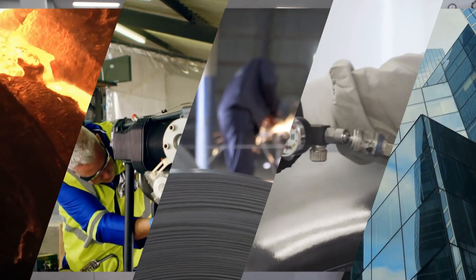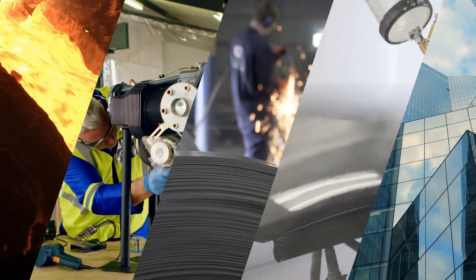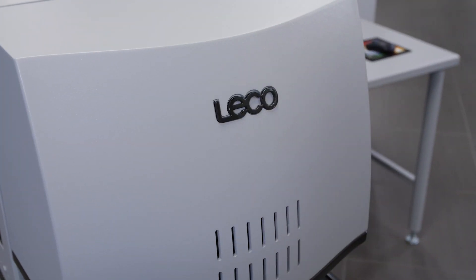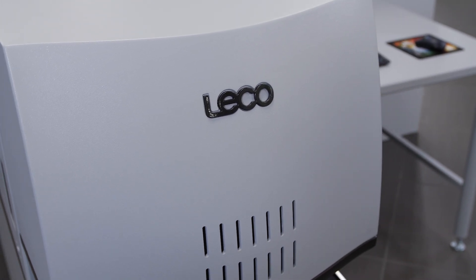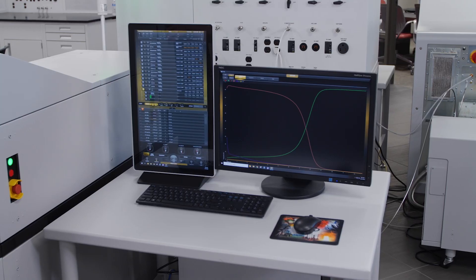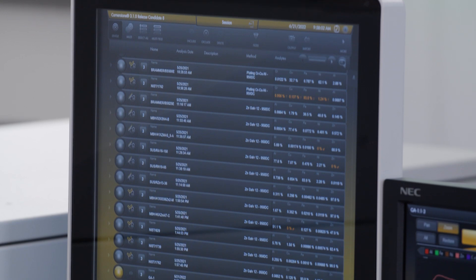Our latest generation of Cornerstone Glow Discharge Spectrometers are designed for the direct determination of the elemental composition of solid samples. Optical emission spectroscopy is a fundamental tool for chemical analyses, but traditional excitation methods require excessive calibration for precise results due to the randomness of their sampling process.